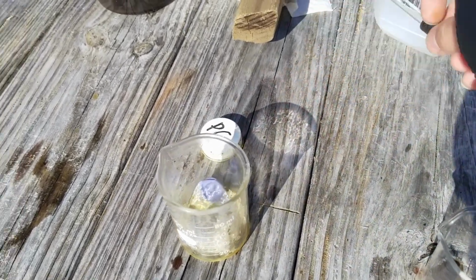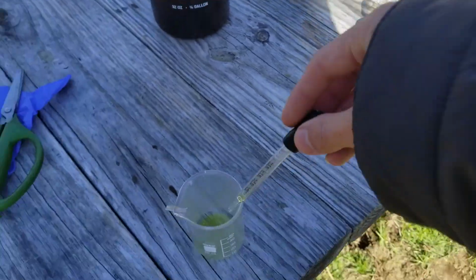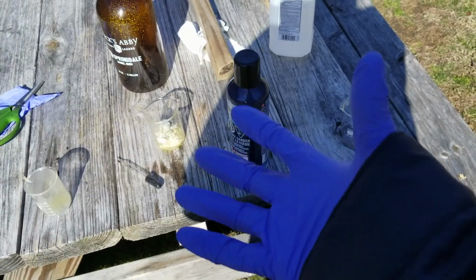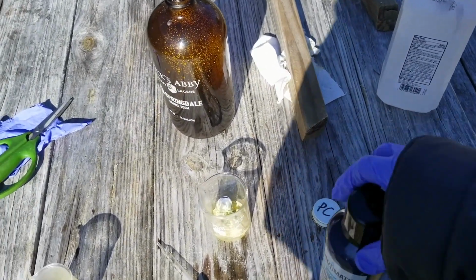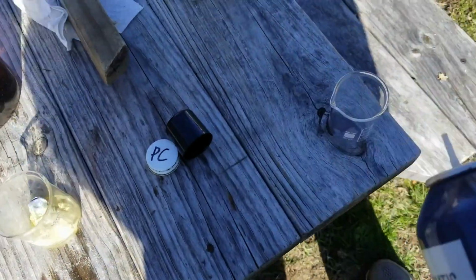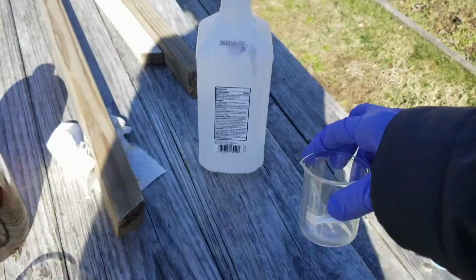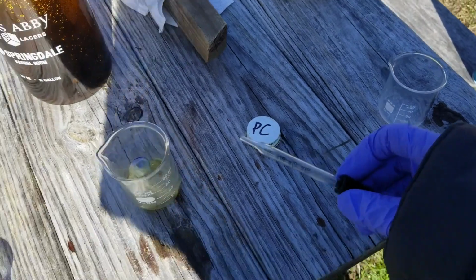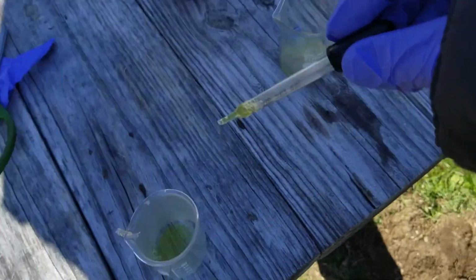More nitric, perhaps? Oh. So first of all, I made the decision to put on gloves, but also, I made this really dumb decision. I'm gonna see what happens if you react it with some butane. Okay, so here I got myself some chilled butane, and before it all evaporates, let's see. Will it burn if I add a bit of nitric to it? What will happen?